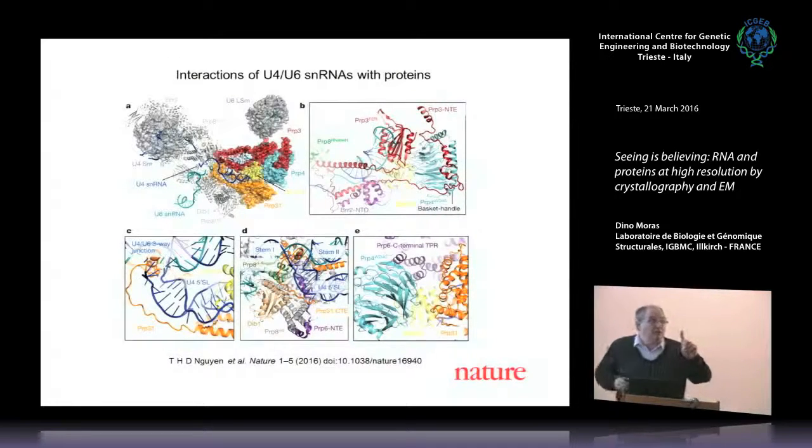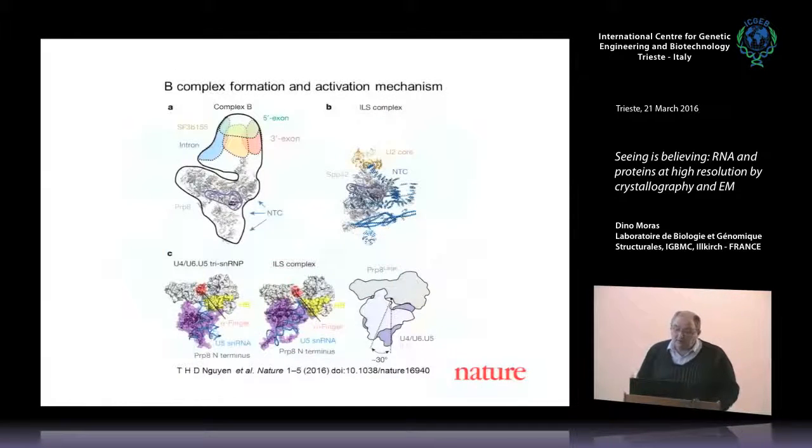But again, this time it's very useful to have the crystallographic data from subgroup to compare. Not only because if the structure is ideally the same, it will fit perfectly, so you get the interpretation. But if there are changes, you see them. So they are double things. And then you can see complexly.